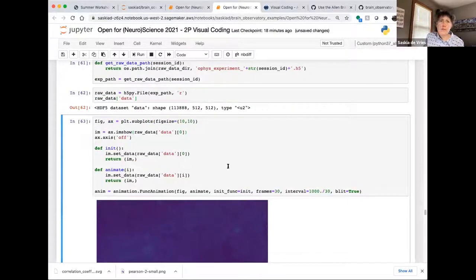If you're somebody who's interested in how we do the cell segmentation, this is an area of active research in the field. We've got 1,400, 1,500 hours of imaging data that is really rich for working on those things. And there have been a lot of people that have used the data in this way. And I just want to make sure everybody sees how they can do that. If AWS isn't your thing, the other thing you can do is send us a hard drive and we can put movies on it and send it back to you. But really, you should get up to speed and use AWS for this because it's just a lot easier.